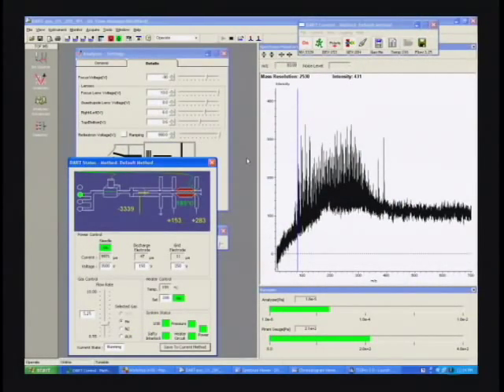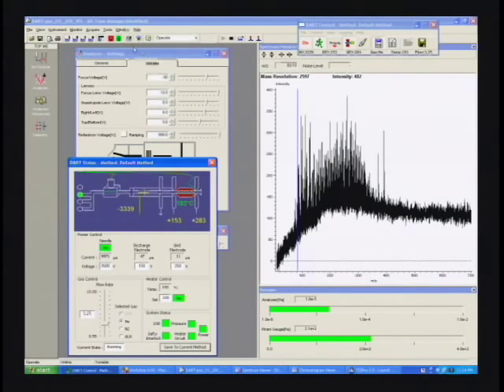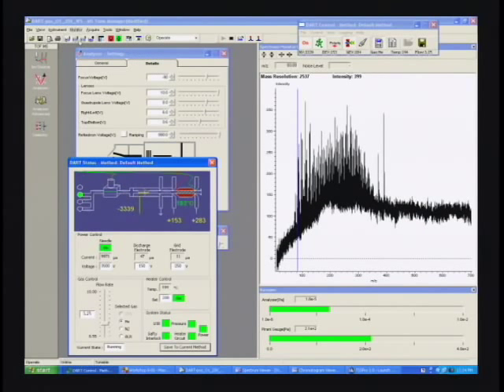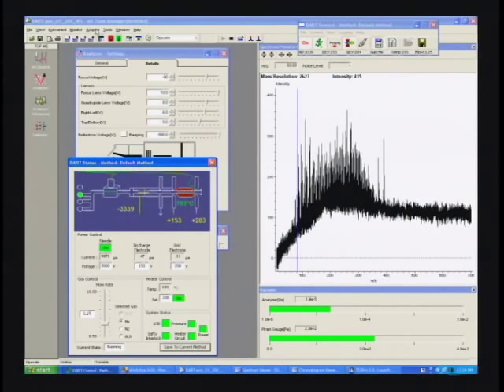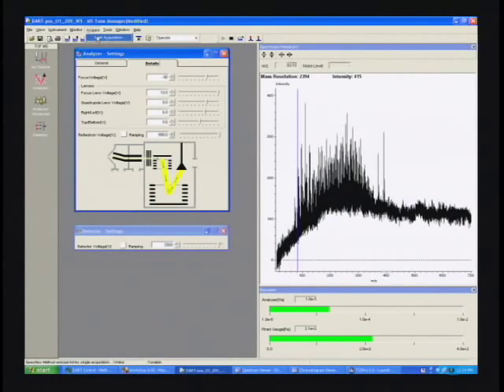The dart's back under fairly standard conditions. We've got a lower gas temperature right now, it's about 200 degrees, and we're back in positive ion mode, not doing anything particularly tricky here.